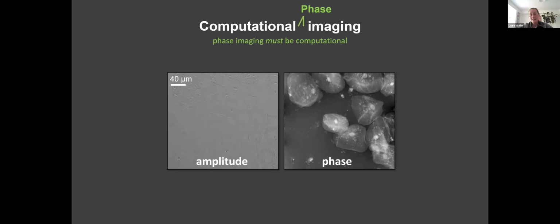Okay, anyways. So a lot of what we do is phase imaging, quantitative phase imaging. And phase information is fundamentally computational imaging because phase is the complex part of the complex field. So x is your object complex field. It has an amplitude and a phase. And the measurements we take are intensity, almost always with a regular sensor. So that's just the absolute value squared of the complex field. So you lose the phase information, and you need some sort of this A matrix here, some sort of system matrix or system forward model that will bring the phase information into intensity.